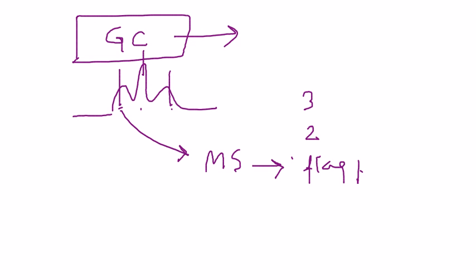This kind of stems from the fact that nitrogen has an even atomic mass of 14, but it bonds with 3 other atoms in its most stable form. And so an even AMU plus an odd number of substituents will give you an overall odd molecular mass. On the other hand, if you're considering an even AMU and an even number of substituents, then it is going to give you an overall even mass.